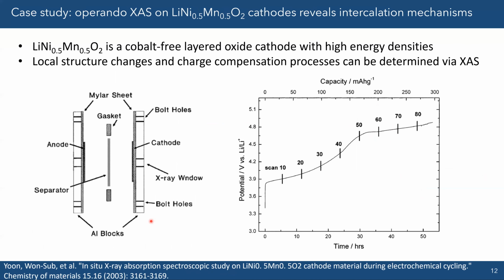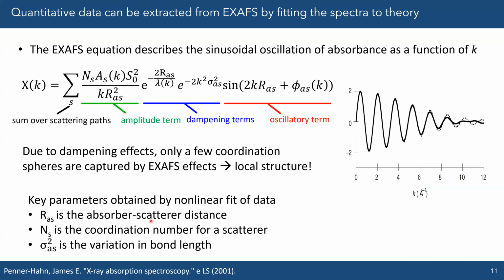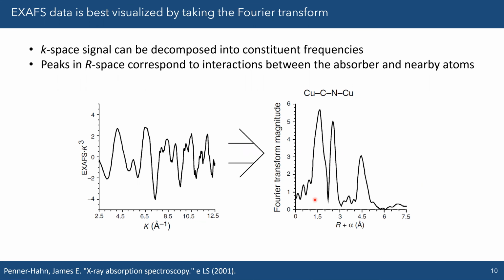Okay, Vincent, so yeah, on that last point, I think it was interesting how you talked about how XAFS is similar to a pair distribution function. For context, pair distribution function basically is a way to handle diffraction data that will allow you to see distances, much in the same way here.